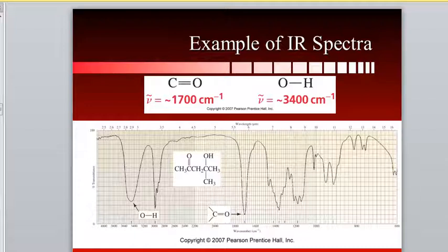Right? Now, our job here is not to figure out what each one of these represents. That's way too much information. No one really can do that, and even if somebody's been in infrared spectroscopy for years, no one probably could tell you what every single band represents.